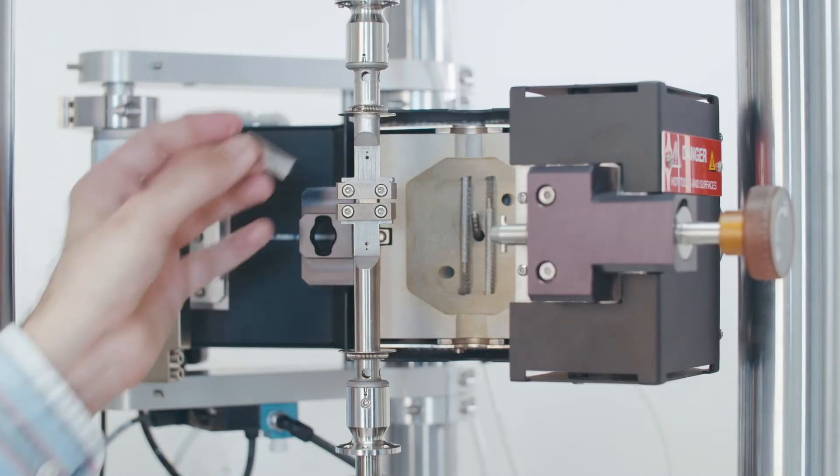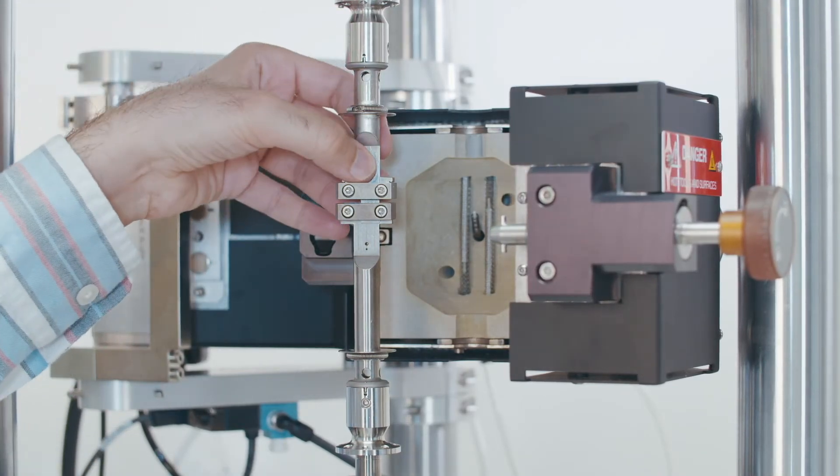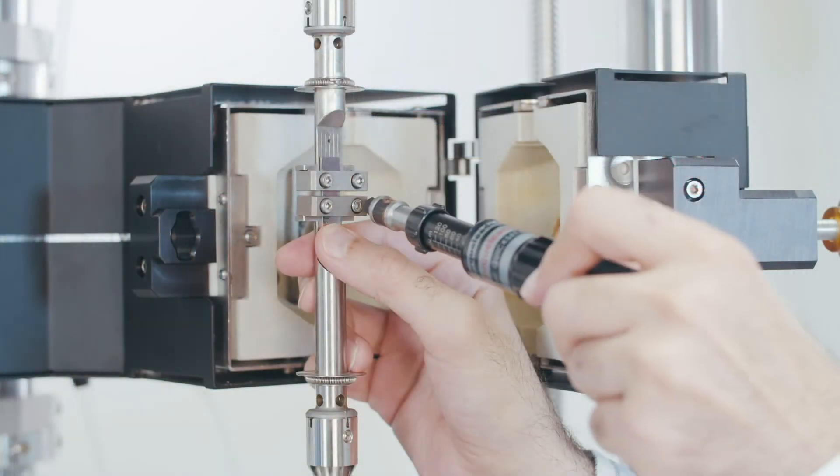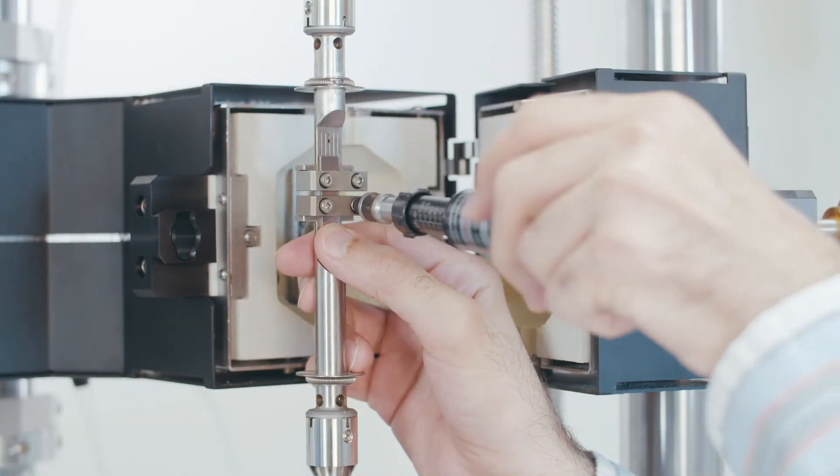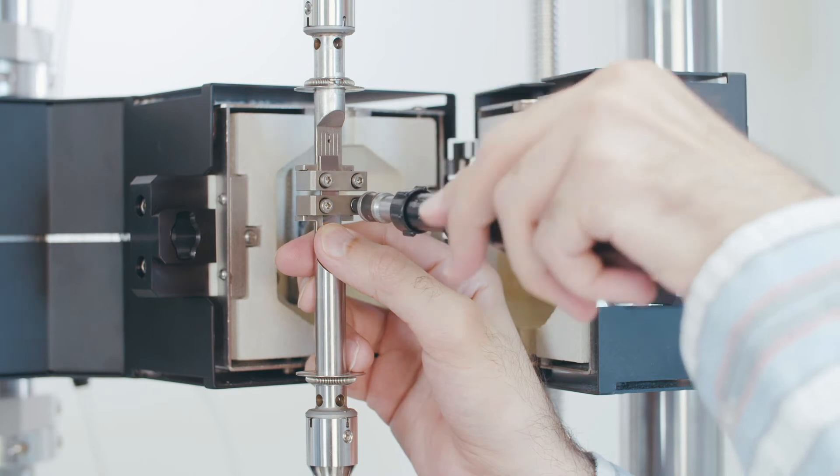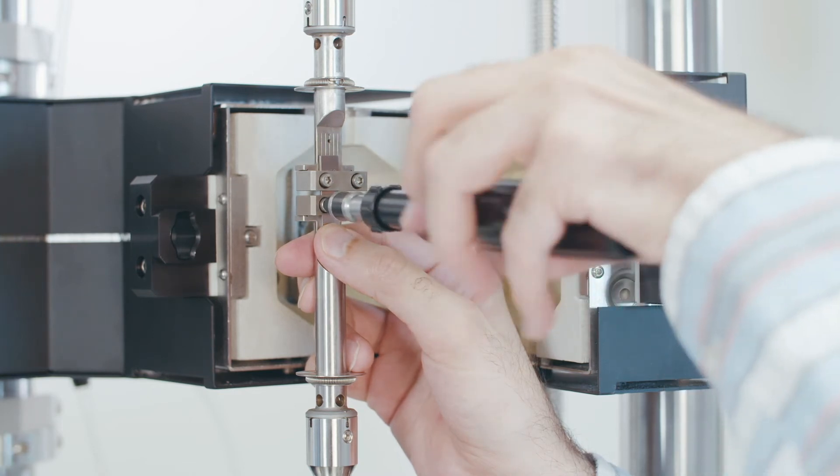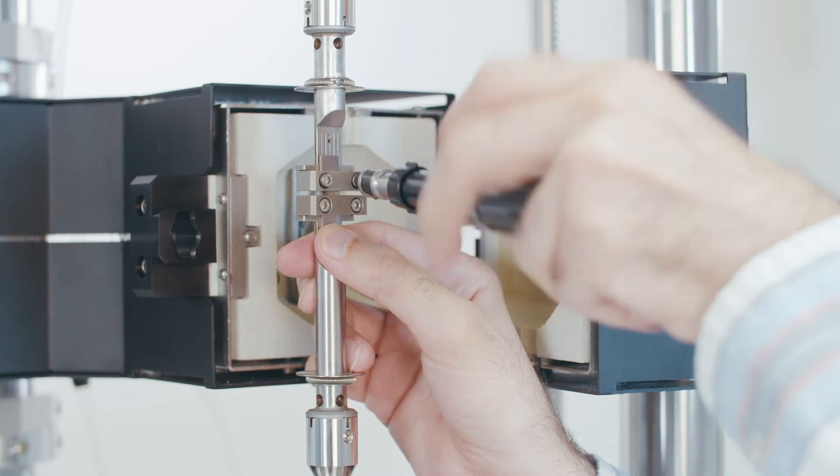The second step is completing compliance compensation routine. Choose the appropriate rigid sample from your rigid sample kit based on your testing geometry. For tensile grips, we will use a rectangular stainless steel bar.